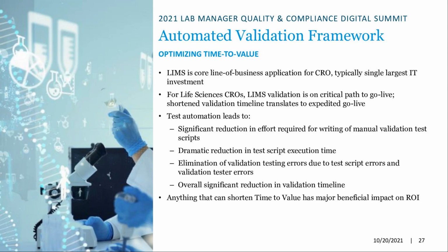What normally took 6 to 9 months just to get your test and validation environments and your production environments up and running, you can do in a fraction of the time. Validation testing has historically been more on the back end, but it's always on the critical path to go live for systems.